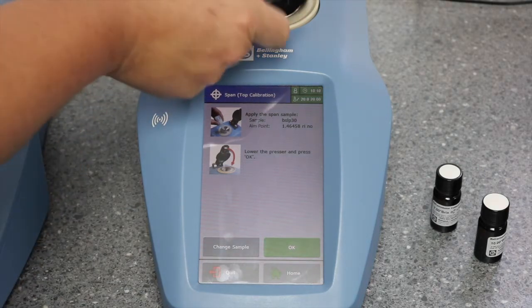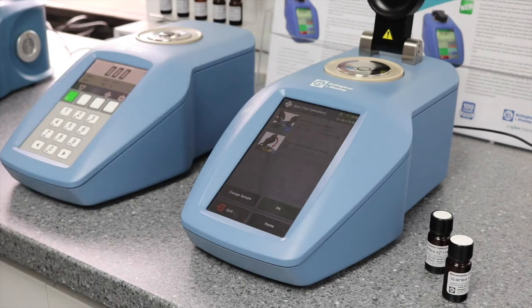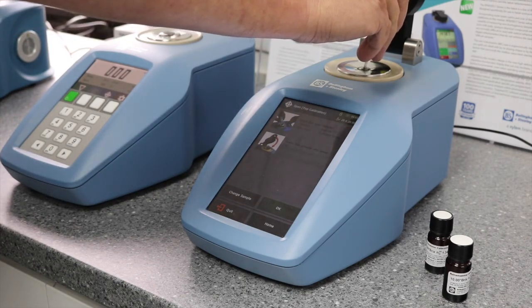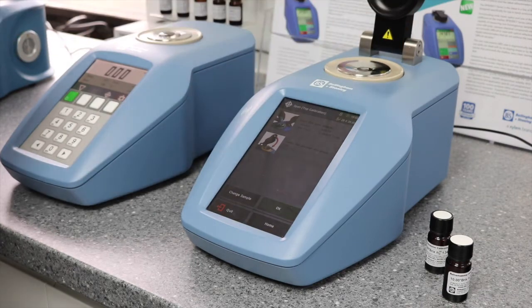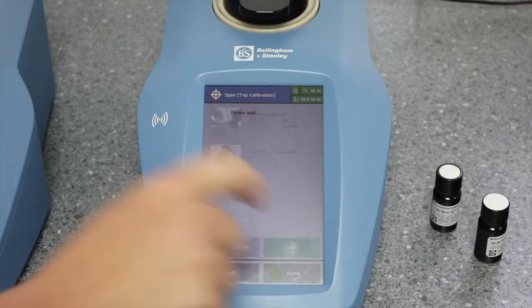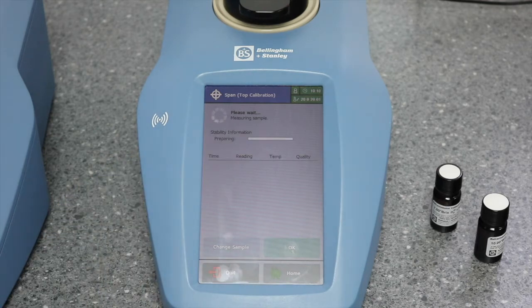Lift the presser, apply the Bellingham and Stanley calibration solution and close the presser. Press OK. The instrument will now check the sample temperature and wait for sample stability before giving a final calibration reading.